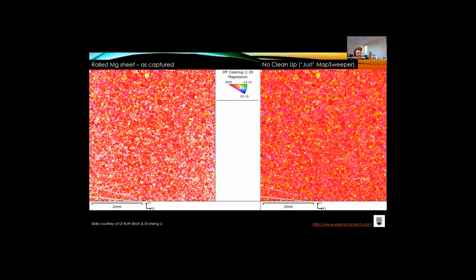Specifically there, the pattern matching method can improve the resolution of poor quality patterns. So fundamentally, the key thing is actually not that it's severely deformed, it's that there are strong strain gradients within the interaction volume. If you have a ceramic system that's severely deformed, the dislocations tend to lock themselves quite close, it will crack, etc. But the key thing here is that it's soft and smears. So you want to think about what's happening inside the interaction volume.